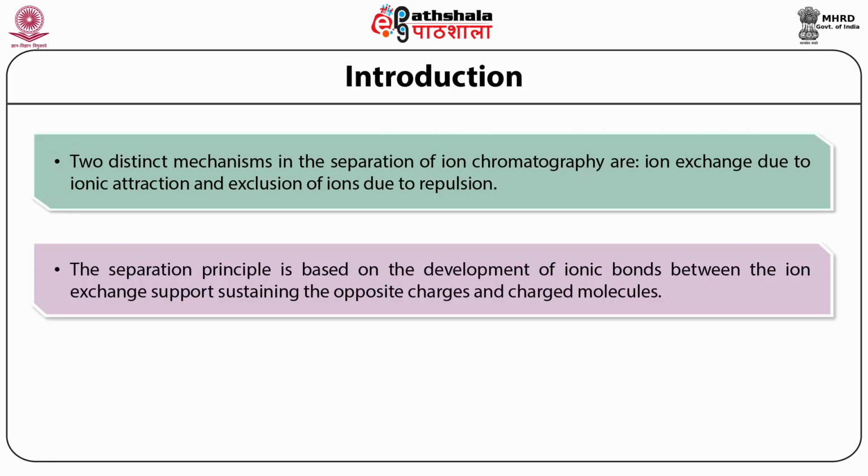Biomolecules exhibit various degrees of interaction with charged chromatographic media owing to their variability in charge properties.